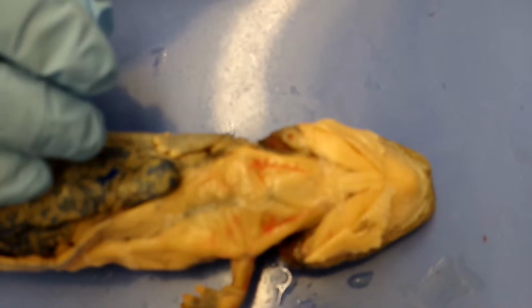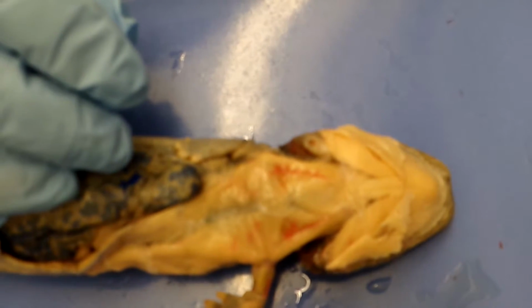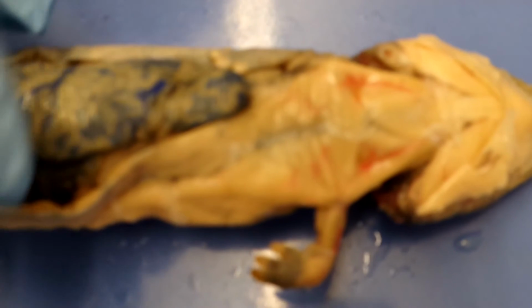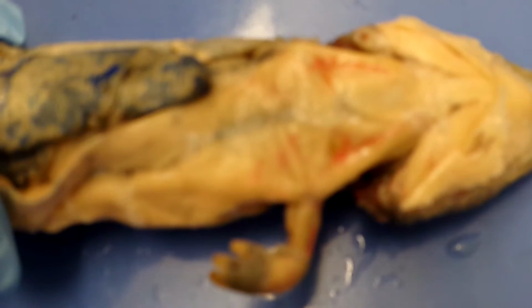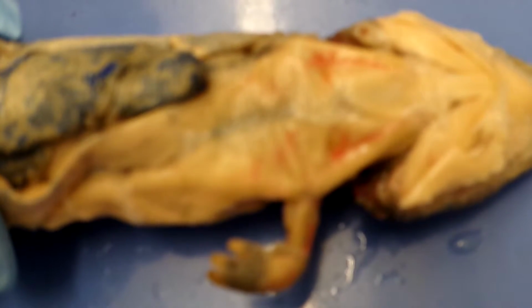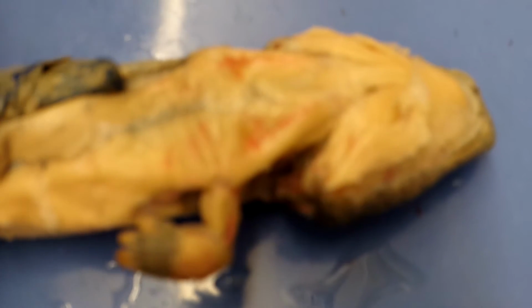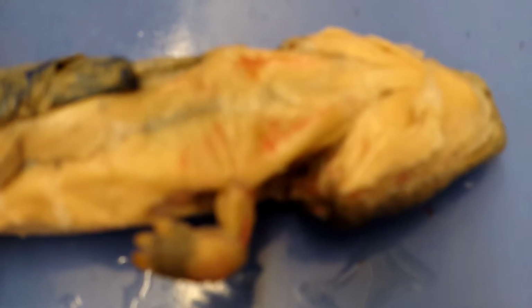The next section is the pectoral musculature, and the first one is the procoracohumeralis, which is found right here. Its origin is the procoracoid, its insertion is the humerus, and it's homologous to the pectoral fin abductors in the shark.